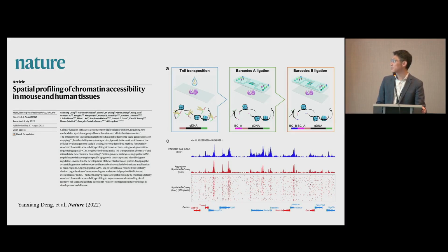What ATAC-seq does is you isolate nuclei, that's the first step, and then use the Tn5 transposase to treat the permeabilized nuclei. The Tn5 transposase has been pre-assembled with DNA oligos, and you know the sequence of those DNA oligos. The enzyme cleaves the genomic DNA and inserts those DNA oligos into the cleaved genomic loci. If the DNA is wrapped around histones, that's inaccessible. If it's open, it's accessible and can be cleaved. So basically, by looking at all the cleavable sites of the genomic DNA, you can map the open chromatin state, or chromatin accessibility profile.